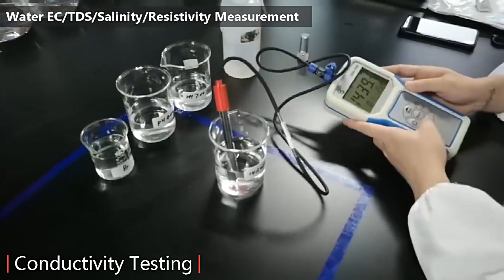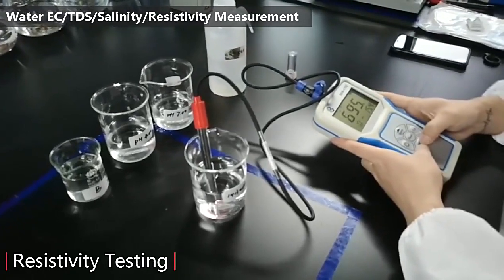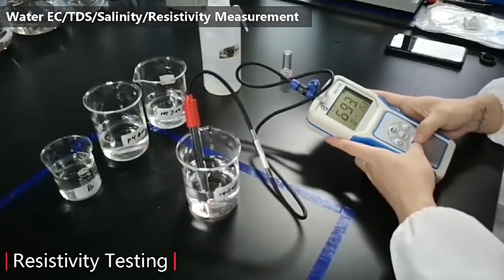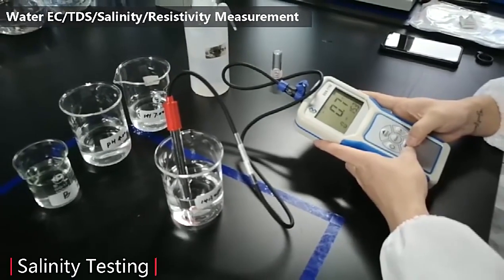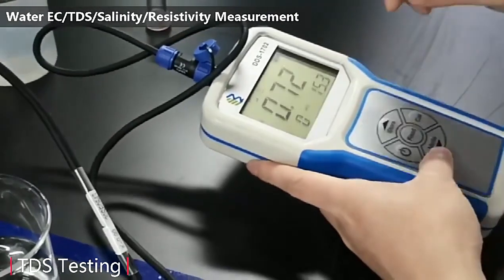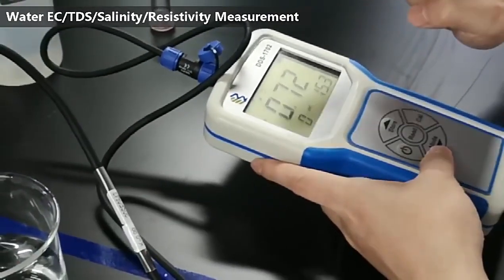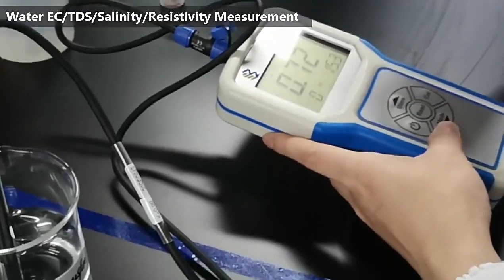This meter can also switch to other modes. First is resistivity — this is resistivity. And also salinity, and TDS value. So this one device can test four parameters: conductivity, TDS, salinity, and resistivity.